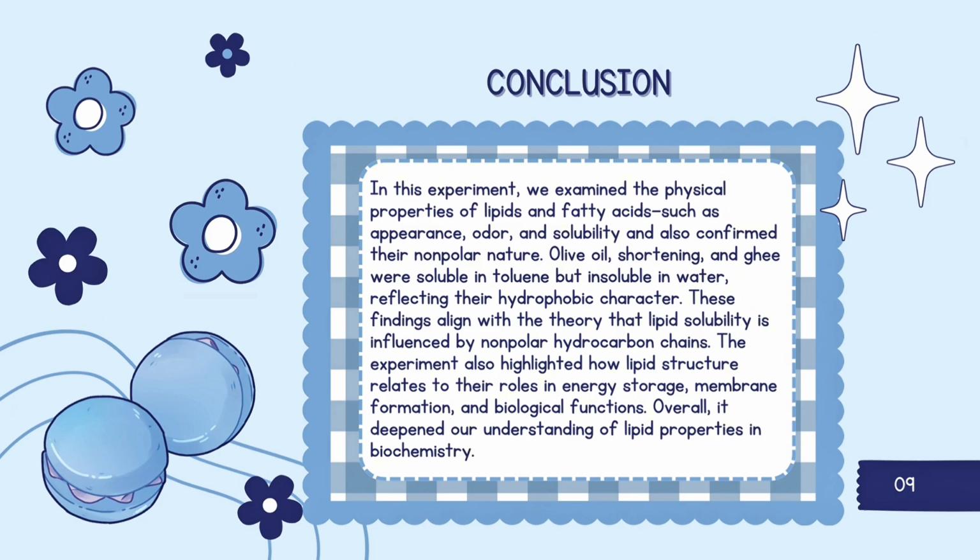For conclusion, in this experiment, we examined the physical properties of lipids and fatty acids, such as appearance, odor, and solubility, and also confirmed their non-polar nature. Olive oil, shortening, and ghee were soluble in toluene but insoluble in water, reflecting their hydrophobic character. This finding aligned with the theory that lipid solubility is influenced by non-polar hydrocarbon chain.